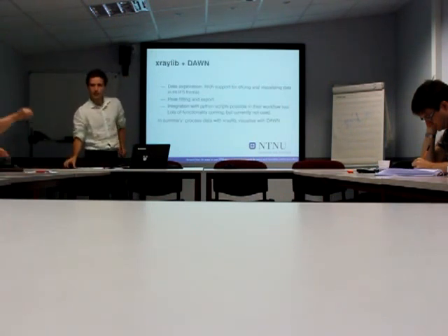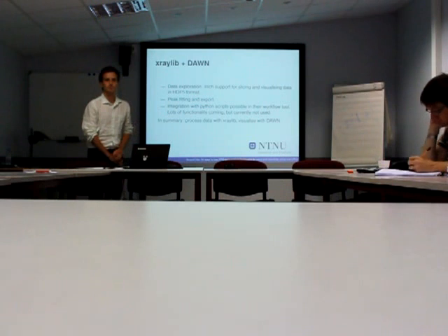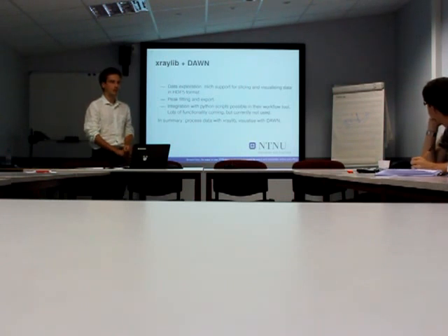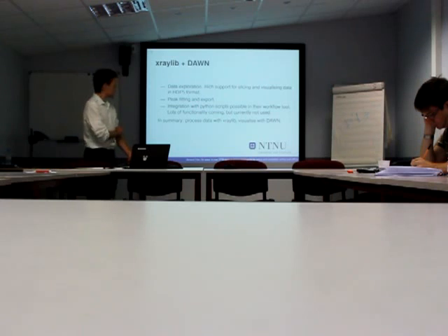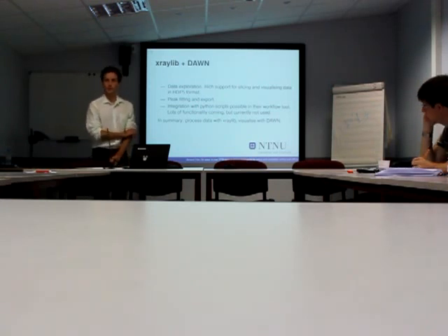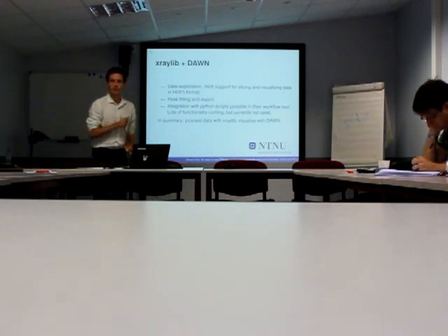So this X-ray lib that I've written so far, it's only good for doing some crude processing. Claudio already mentioned Dawn, which is software developed in collaboration with Diamond. It's very nice for data exploration. If you have your data, you can slice it along the different dimensions and do peak fitting and simple stuff like this.